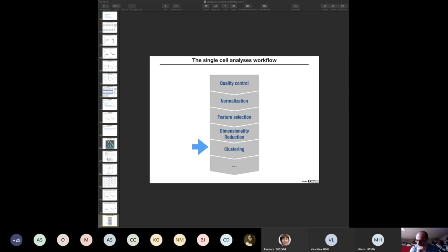You have to fix some threshold at the beginning, but bear in mind that it's not set in stone, and you can always change it and redo the analysis.